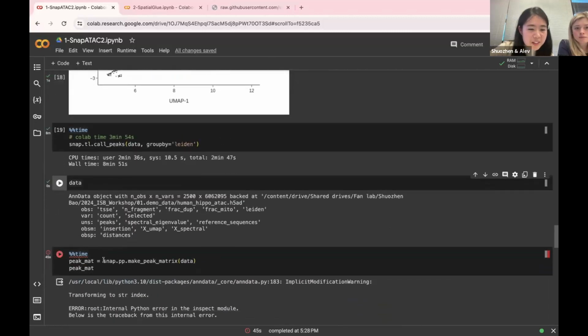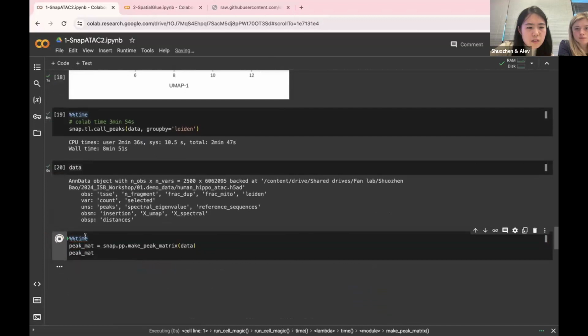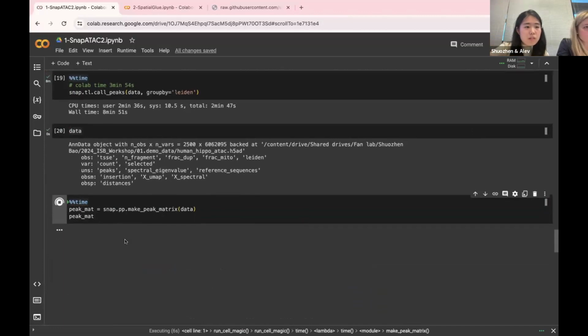We're encountering an error here. Really weird. I'm not changing anything.